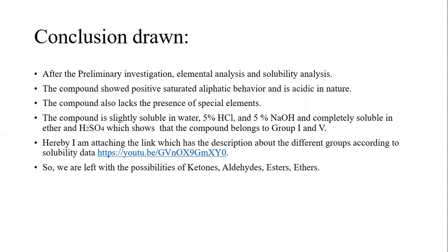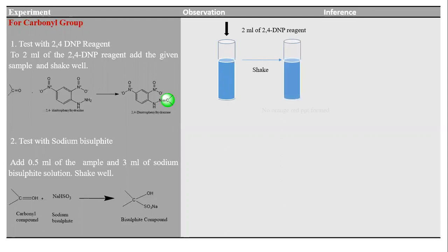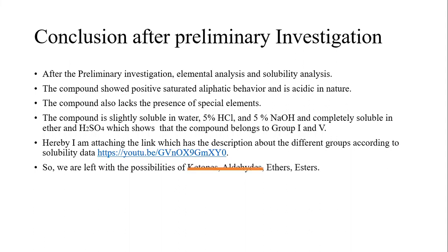We will first test for ketones and aldehydes, together called carbonyl compounds, using the 2,4-DNP reagent test. We have the carbonyl compound react with 2,4-dinitrophenylhydrazine, which converts to a 2,4-dinitrophenylhydrazone with an orange or yellow color. Here we are not getting an orange or red precipitate, so the carbonyl group is absent. We also test carbonyl group presence with sodium bisulfite — dissolve the sample in 3 mL of sodium bisulfite solution and shake; a white precipitate indicates carbonyl presence. Since no precipitate formed, the possibilities of ketones and aldehydes have been ruled out.